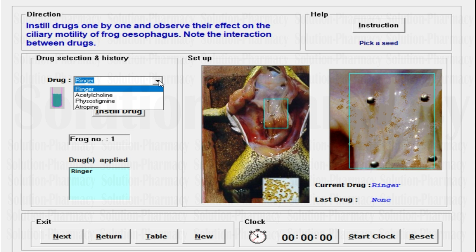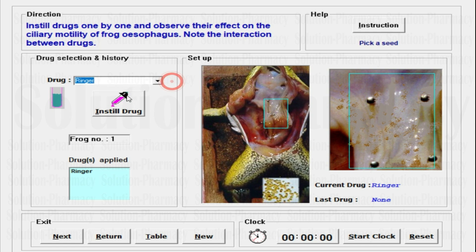Then we have acetylcholine, physostigmine, and atropine. You need to go through them one by one. After that, you will see the Instill Drug option. You have to select a drug and then click on the Instill Drug button — only then will the drug start acting. Then you will observe the frog number. If this is the first experiment, it will show as frog number one. Once you click the New button, the frog number will change to two or three as per your next selection.